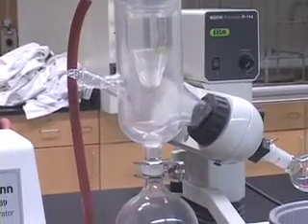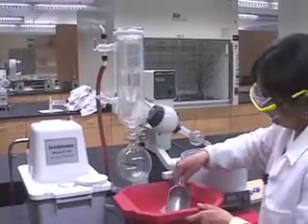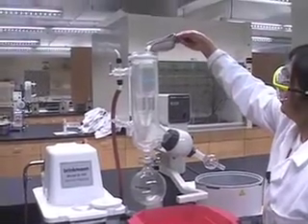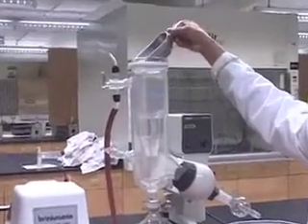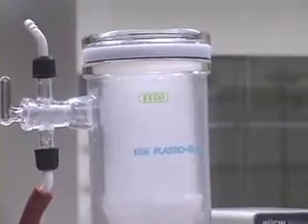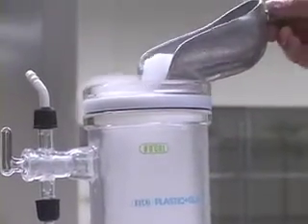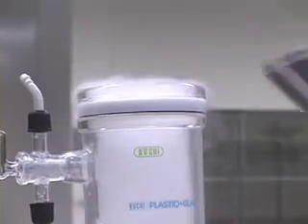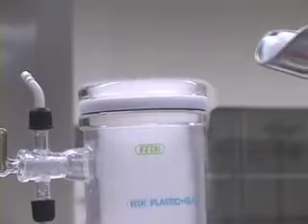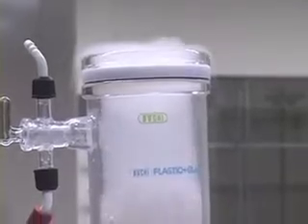So, let me add some dry ice. So, we will add dry ice carefully. We all know what dry ice is. It is solid carbon dioxide. So, a mixture of dry ice and isopropanol gives very cold temperatures.